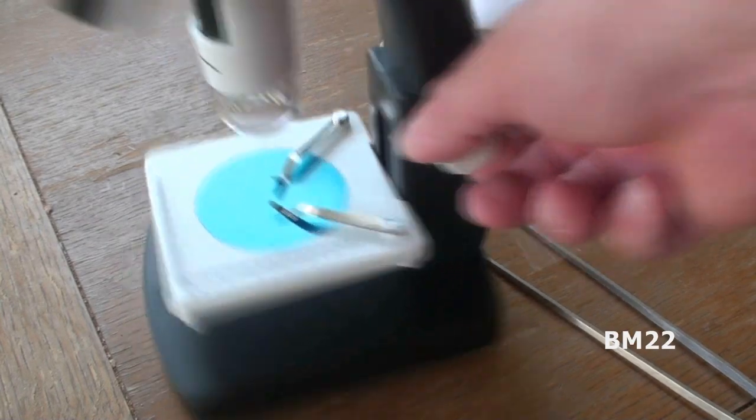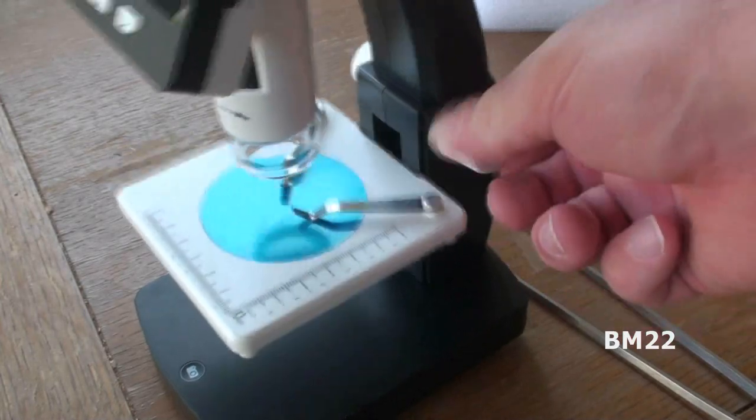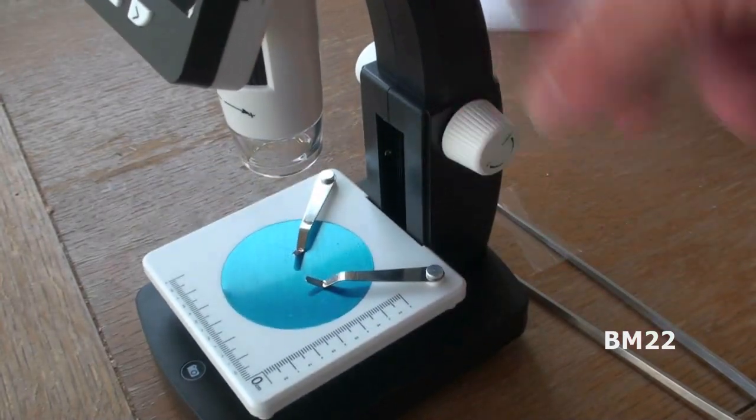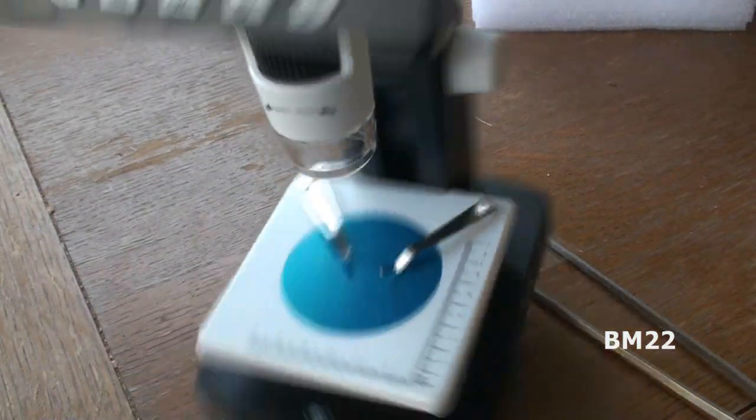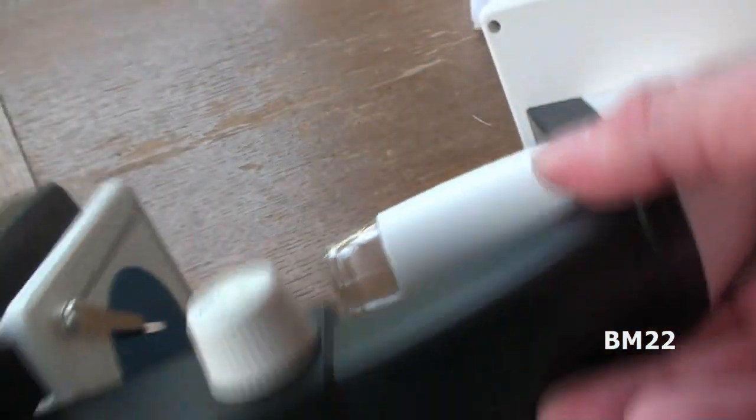Okay, we're back out there in YouTube land. I think that took what, five seconds, three seconds? In the real world, this is a week later. We could not get this microscope to work. Tried it dozens of times. I mean, it's a total piece of junk. Waste of $100.